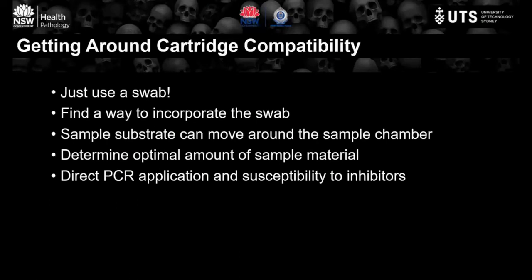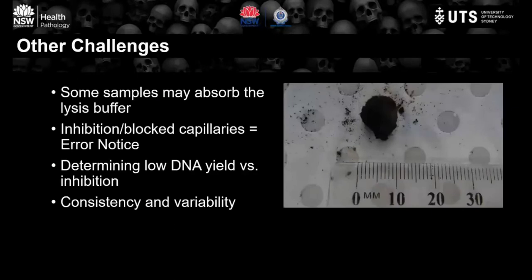Direct PCR action may mean we're more susceptible to inhibitors with these sample types. Bone contains inhibitors, and we have additional inhibitors from decomposition by-products or soil — we may need to balance this with a quick clean-up. In the case of bone shavings, they appear to absorb the lysis buffer, ultimately leading to failed analysis, further complicated when too much bone is used. In the case of dirty samples causing inhibition or clogged capillaries, a warning notice will appear, but it can be as simple as running a blank in between. In the event of a failed analysis, it can be difficult to distinguish between no or low DNA versus inhibition, and these would guide further testing.